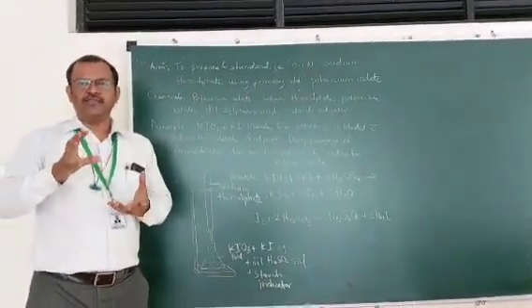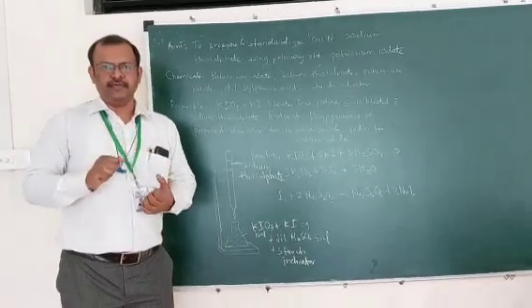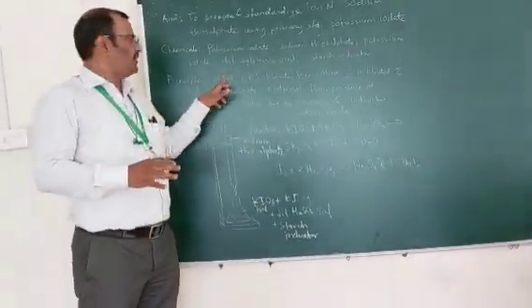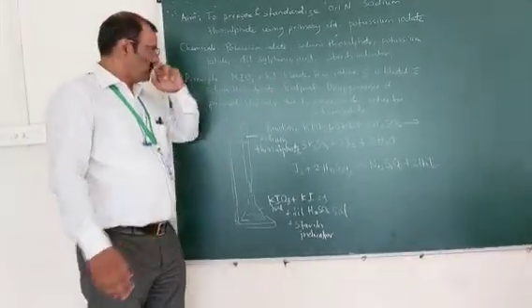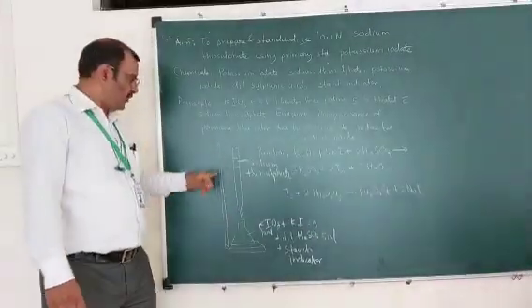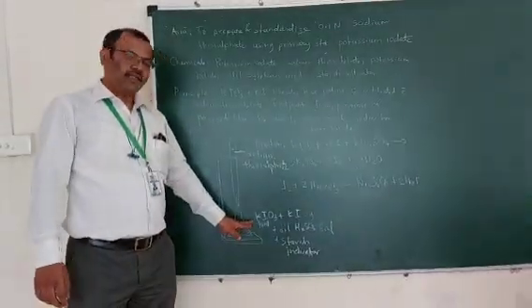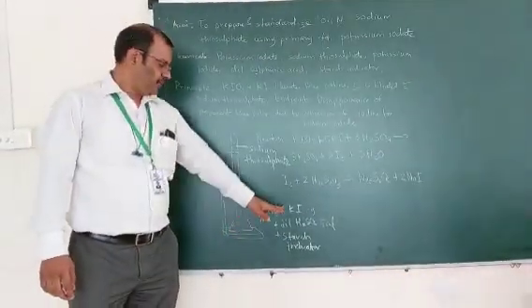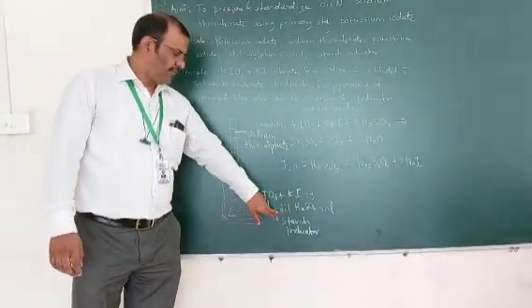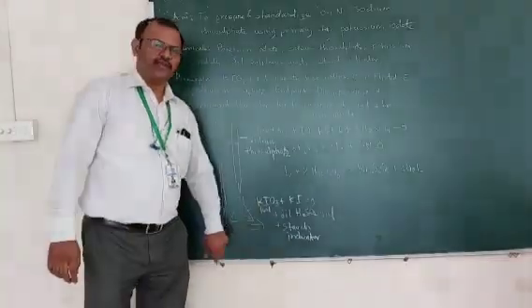While performing the practical, we wait for 10 minutes, keeping it in the dark until iodine is liberated. Then this is added in a conical flask, and we titrate it with sodium thiosulphate. Sodium thiosulphate is in our burette, and in the flask we are taking 10 ml potassium iodate, 2 gram of potassium iodide, and 5 ml of dilute sulfuric acid. And 2-3 drops of starch indicator we are adding.